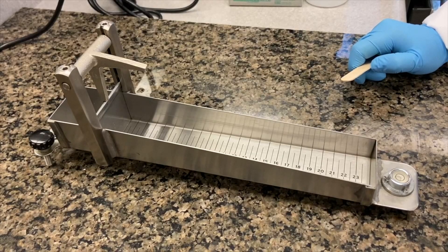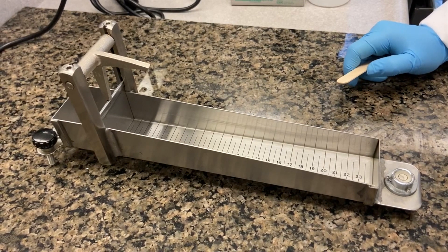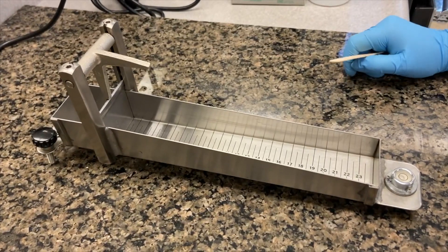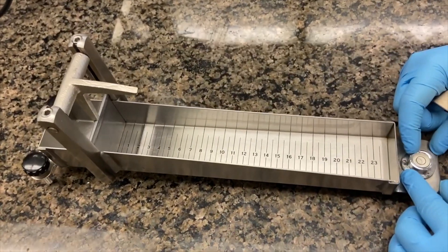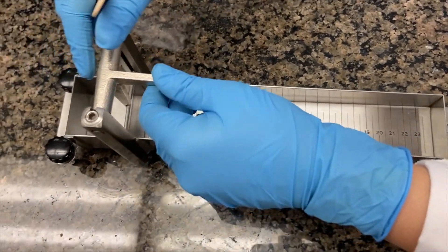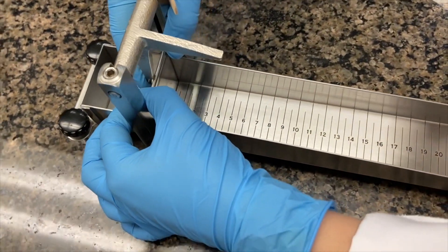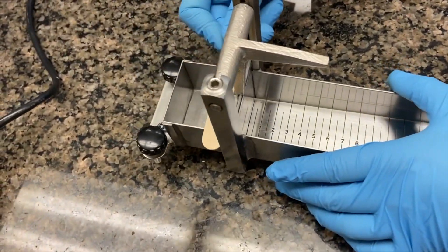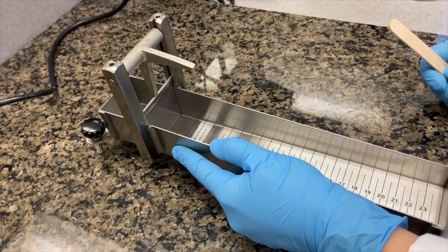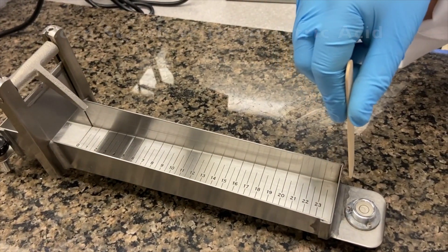Now we start using the Bostwick consistometer to observe the flow of suspensions. We will start at 70°C and continue decreasing at 15-degree intervals. The Bostwick must have the level bubble centered, which you can adjust. Your sample is placed in the trough, lowered down, locked, and you use a flat stick to flatten the sample. Set your timer for one minute, then release — the sample can travel up to 24 centimeters.